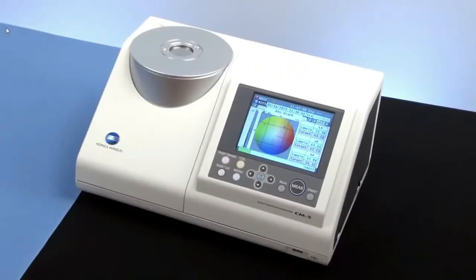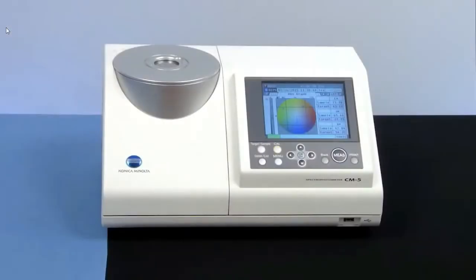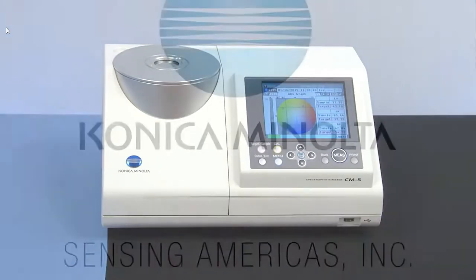Enhance your color evaluation program and easily adapt to any measurement requirement with the versatile CM5 benchtop spectrophotometer.